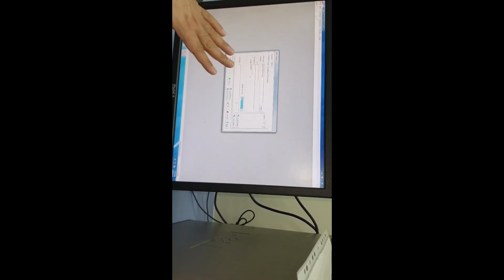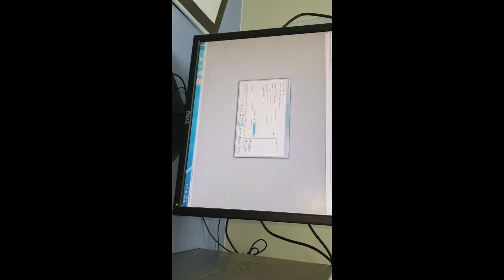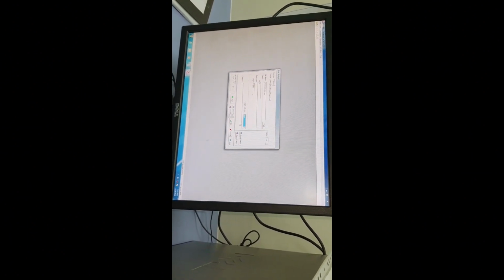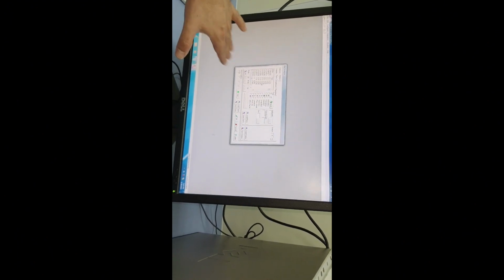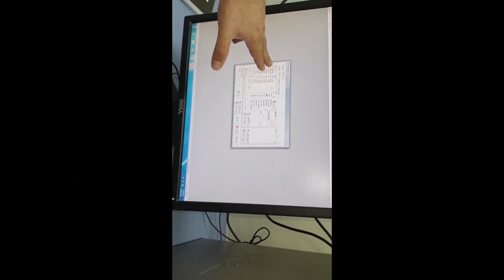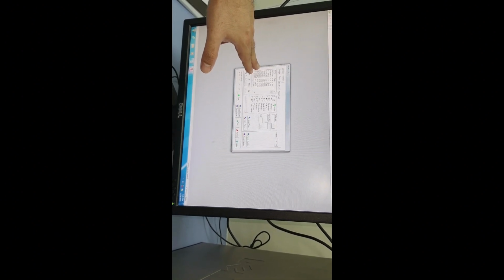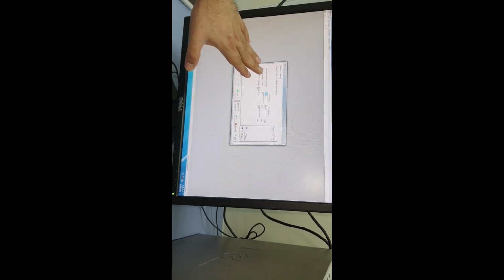Sorry, I forgot to mention this. It's not about desorption. You have to weigh the sample, enter the weights, and then we have to enter the temperature here in the software. These are the saved previous files, so we can use any one of them, or we can also create our own method.